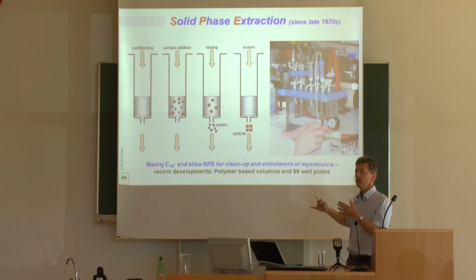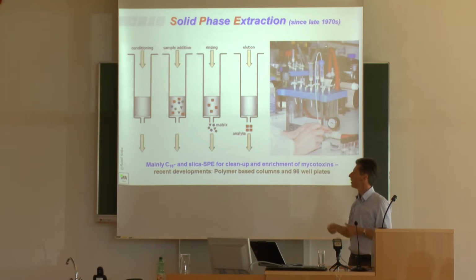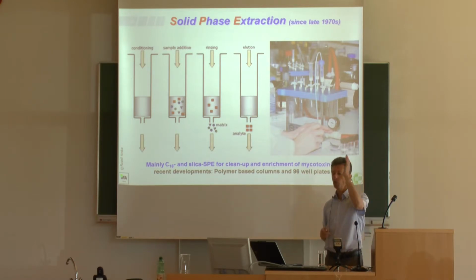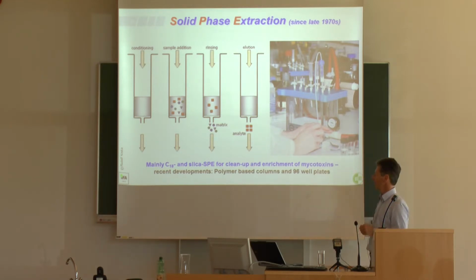But you can use the solid phase extraction column in different modes, right? You can also play it the way that you don't elute: you add your sample, your matrix remains on the cartridge, and your analyte, your mycotoxin, goes through the column right away. There are different ways and different strategies.